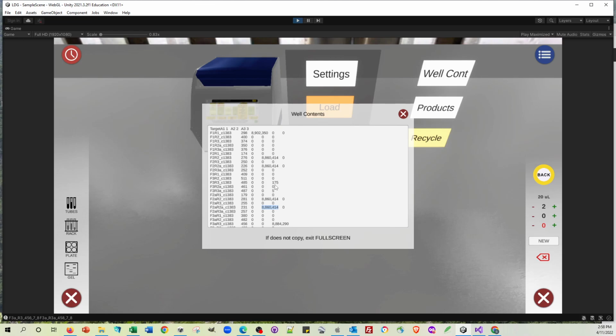But two big things that I've still got to do. One is to make sure that each cycle we're keeping track of the primer use between reactions. So at the moment we're keeping track of dNTPs and primer concentrations within a reaction, but we need to do that across reactions within the same tube.